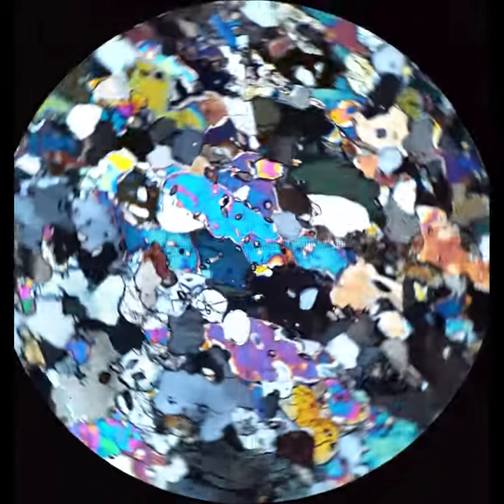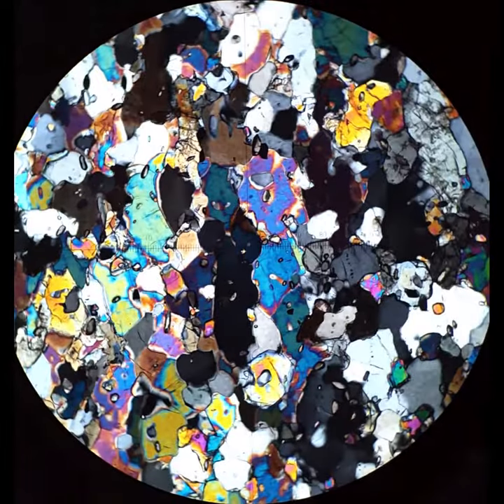And what catches me by surprise is when I cross the polars—oh, what is all that colorful stuff in there? Then I sort of scratch my head and then I remember scapolite.